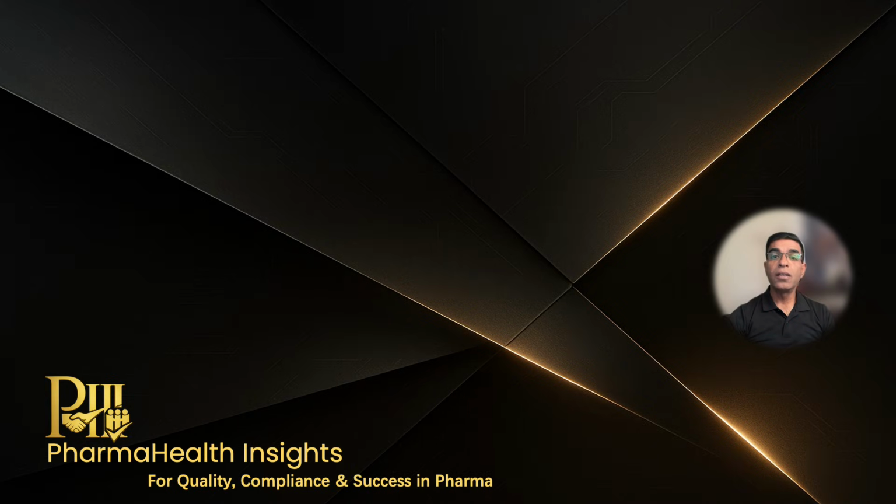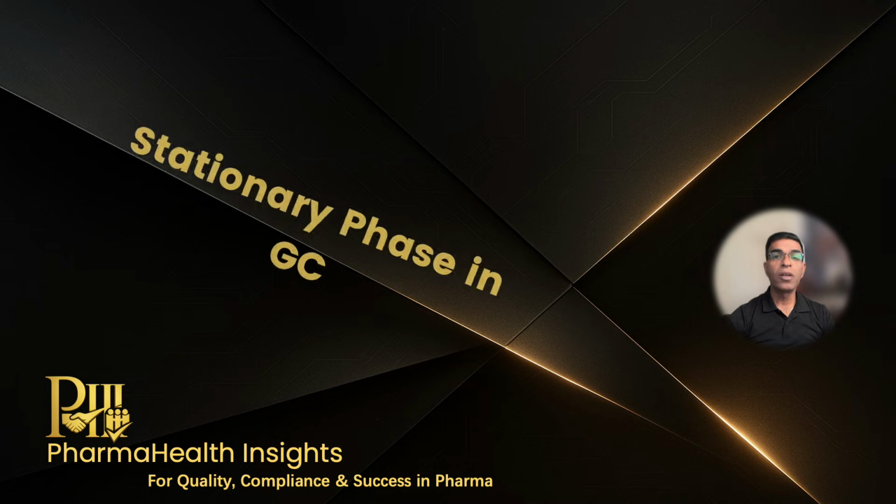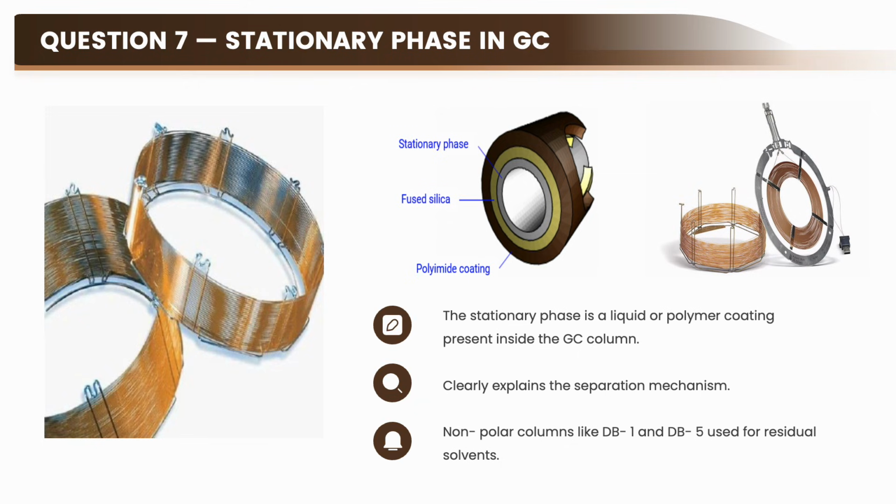After the carrier gas, now the interviewer will move to the next important concept. What is stationary phase in gas chromatography? You should answer very calmly. The stationary phase is a liquid or polymer coating present inside the GC column. Separation occurs due to differential interaction between analyte molecules and the stationary phase. When you also mention commonly used columns like DB1 or DB5, it reflects real QC laboratory exposure. At this stage, your GC fundamentals are clearly established.